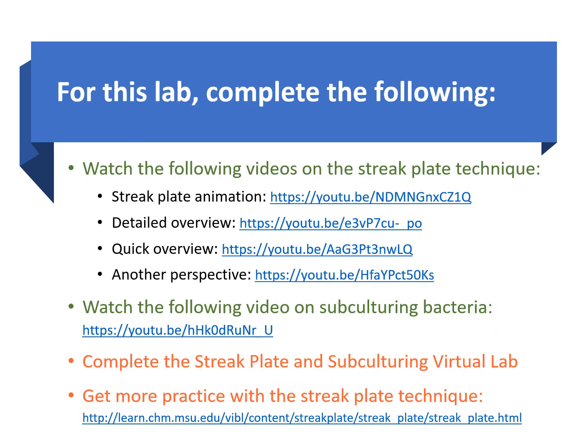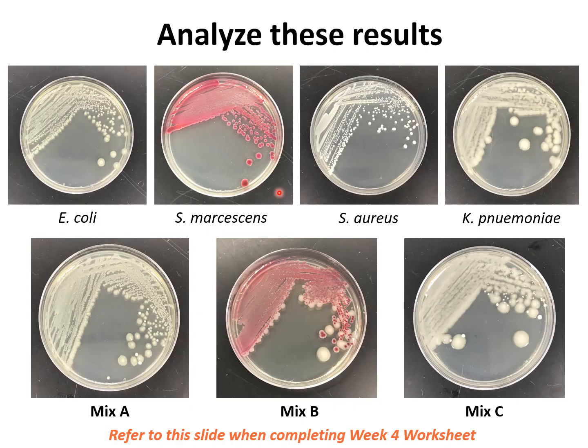And then right here, as I said, there are a bunch of videos that you can watch to help you out with the streak plate method and the subculturing and everything. And there's a virtual lab that you're also going to do for this lab. And this is an image that you're going to use to answer some questions on your worksheet. You see that we have here multiple streak plates of pure cultures.